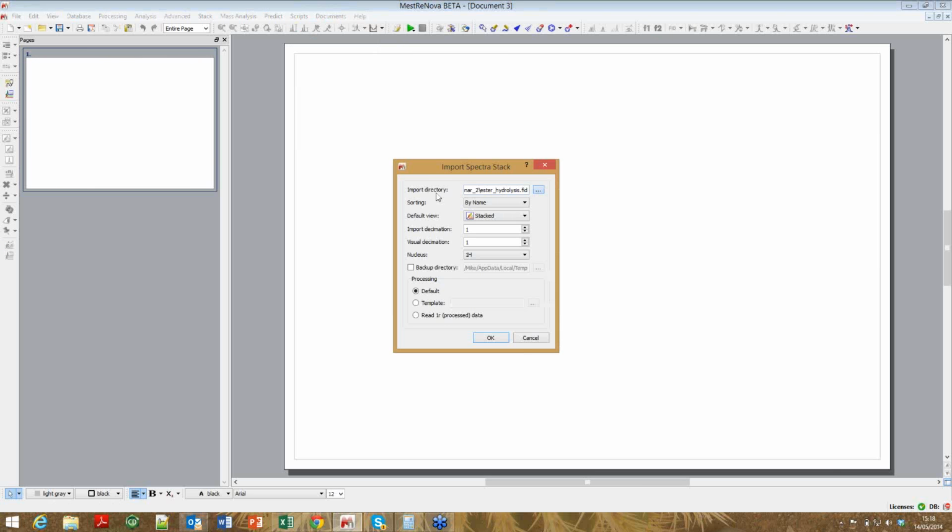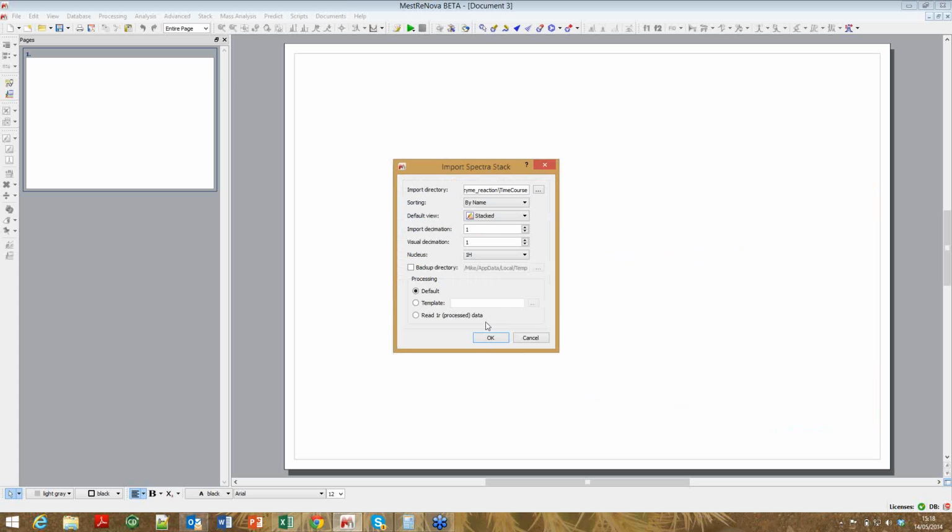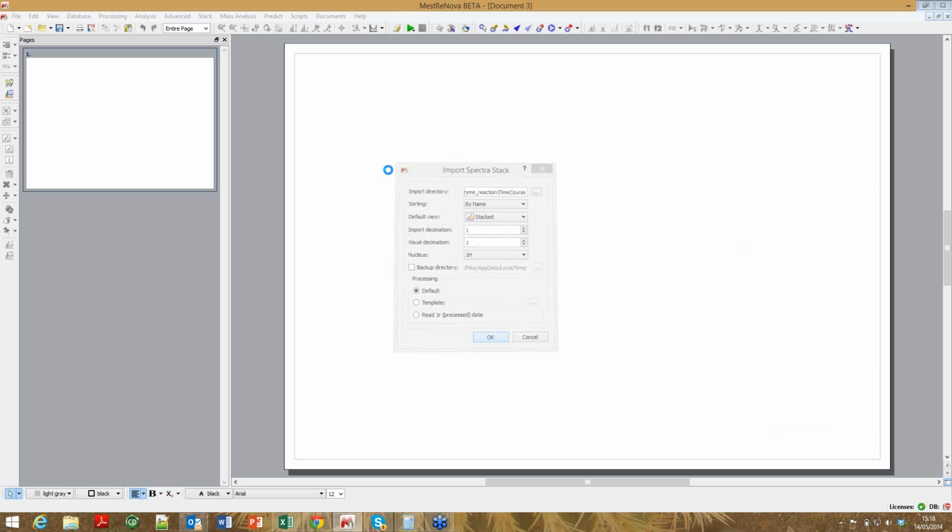Right, so let's see, we've got an enzyme reaction. What I want to show you in this is another way that we can get the concentrations right. You'll notice that I've got concentrations here nicely for some of these.